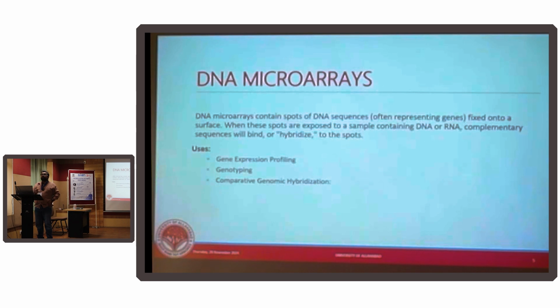One thing you need to remember, these are always targeted assays. These are not by far discovery. Why? Because in most cases you know what is what in the array. So this is one challenge of a microarray, that you cannot do much of discovery work, except for a few things that we will understand very soon. You can also find single nucleotide polymorphisms if you're working with DNA. So these kind of stuff you can do.